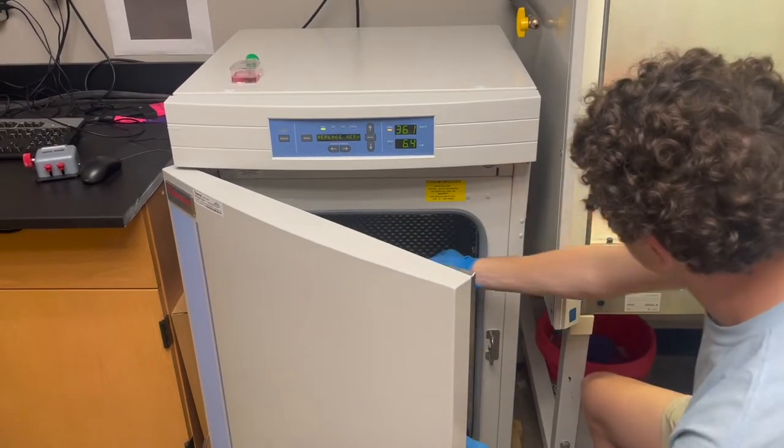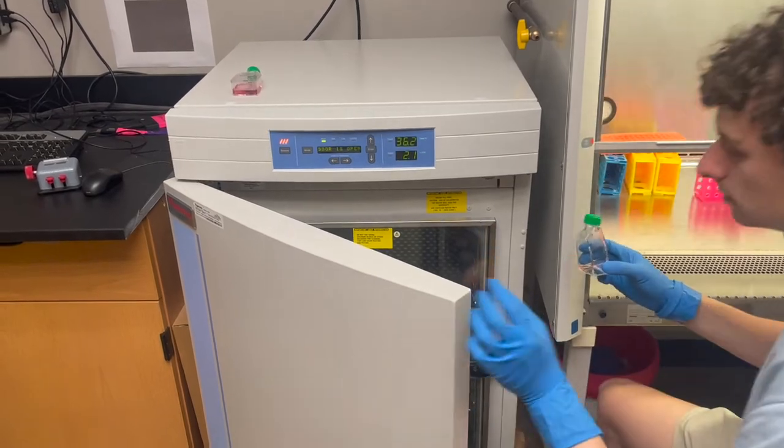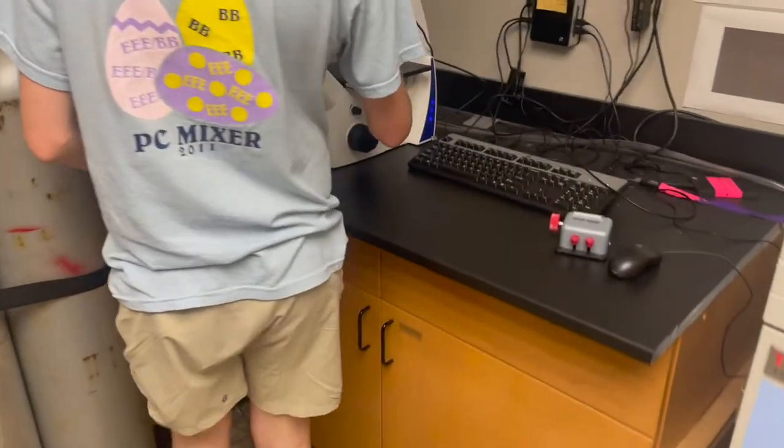After 5 minutes, look at the cells under the microscope to make sure they have detached and are floating in the media. You can gently tap the sides of the flask to help them come loose if needed.